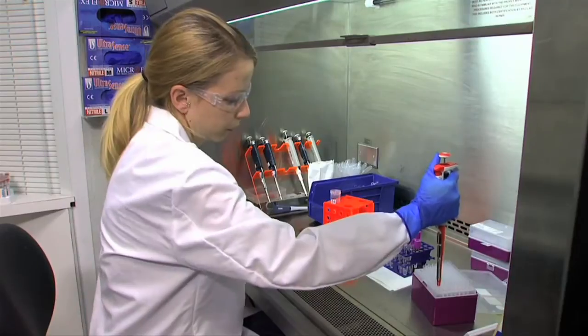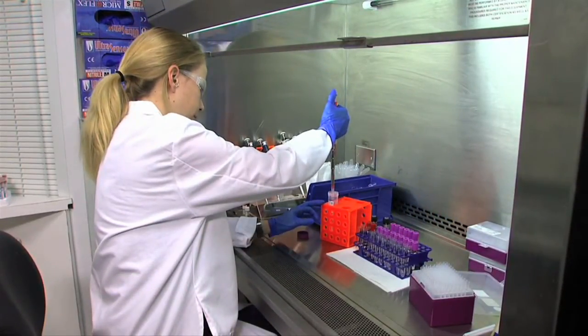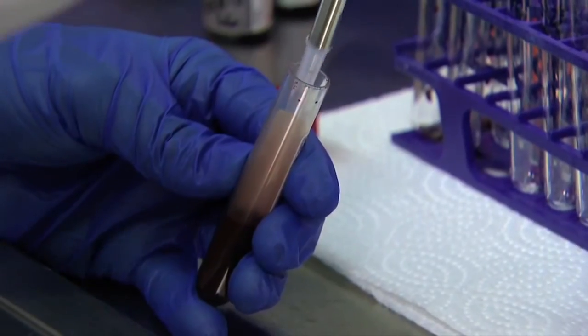I really was looking for an instrument that did not require a lot of upfront sample handling. In order to run flow cytometry in the past, you needed people to do a lot of pipetting. The reagents for the instruments are usually very expensive, and there can be some wastage in there if you don't have good technique.